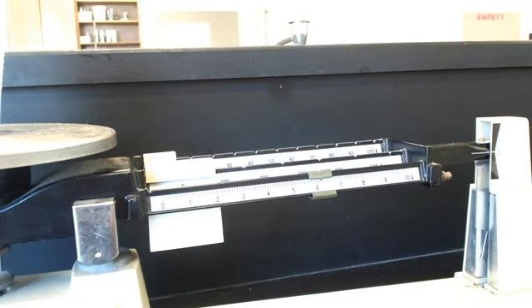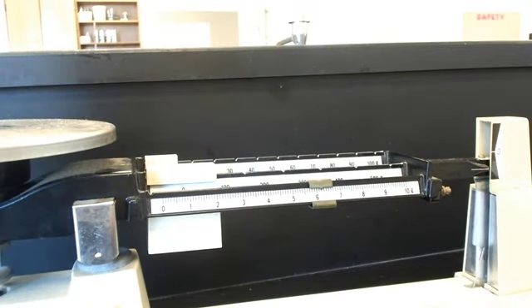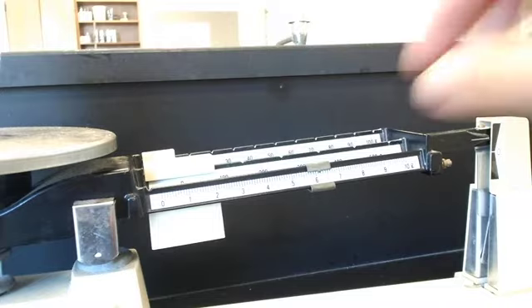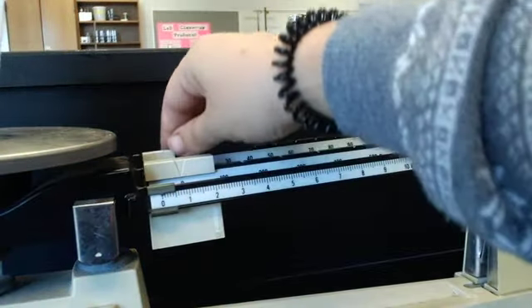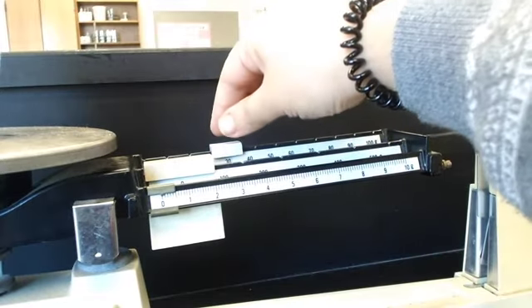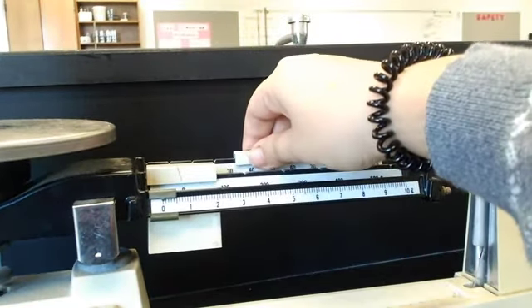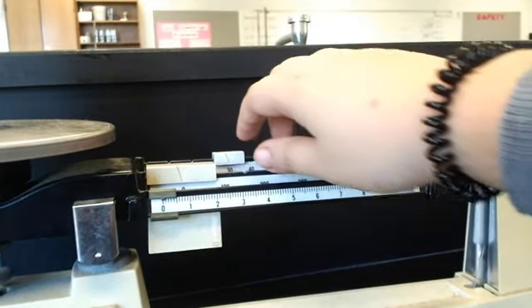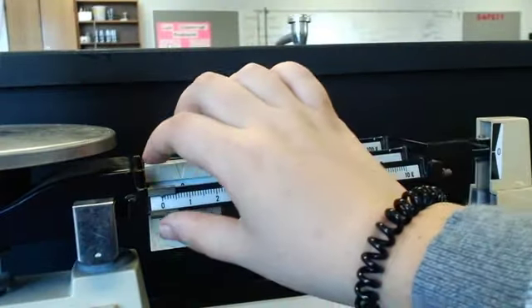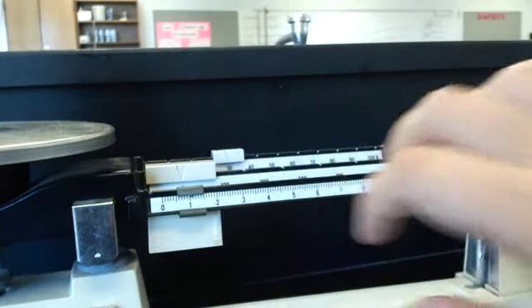And then I need the mass of my large beads, which I can already feel is a lot more than this. What is that? Okay, we need a different sample then. So, I don't know.